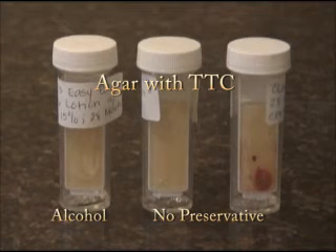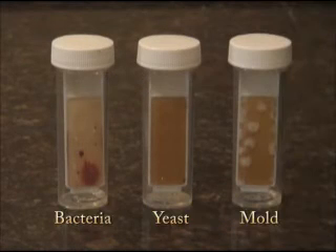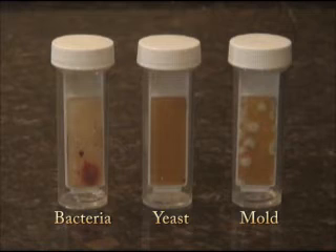Here we display the different types of growth on the slides. Bacterial colonies appear as red dots because when bacteria use the TTC indicator on the lighter side of the test, they metabolize it and it turns red. Yeast colonies quickly appear as clear dots, shown in the center slide. Mold and fungi appear as fuzzy growths, shown on the right.